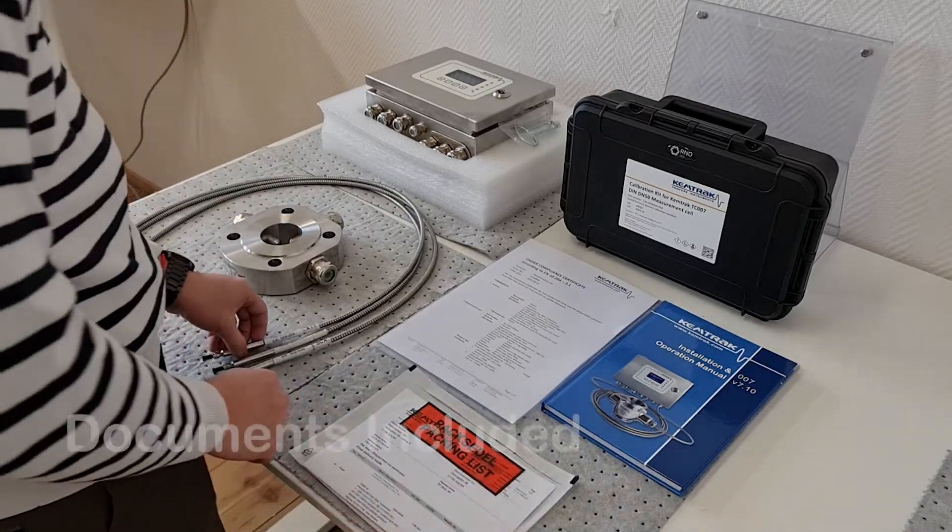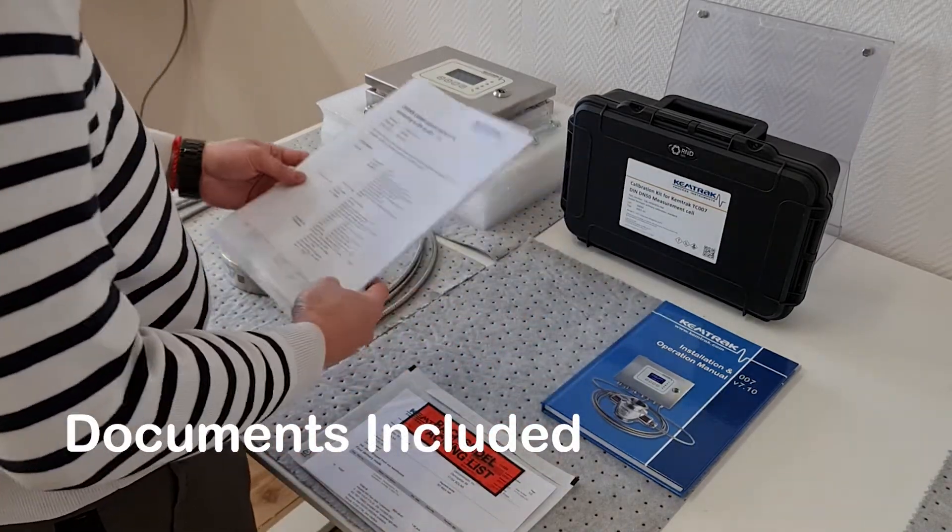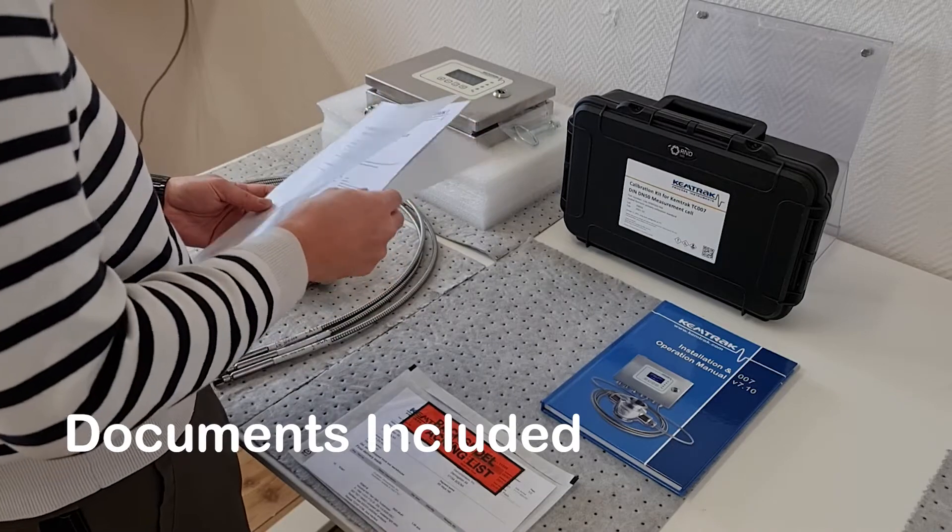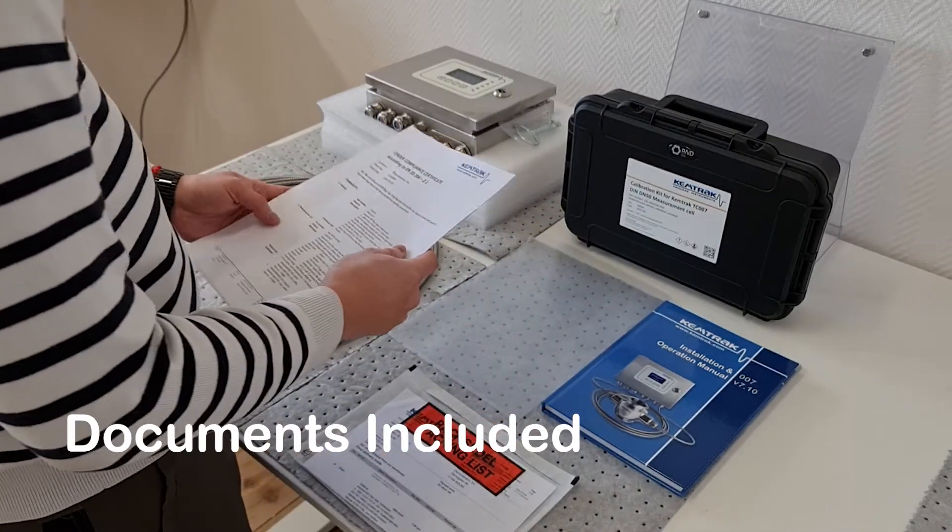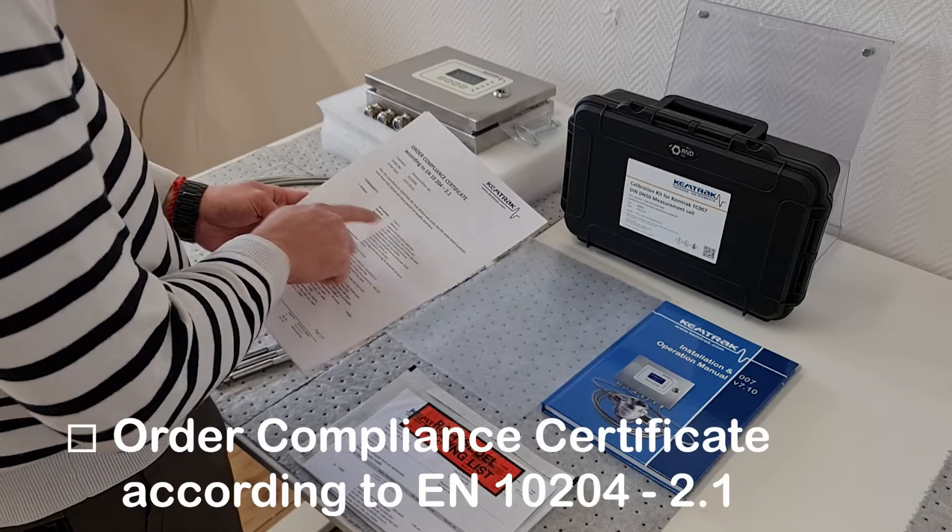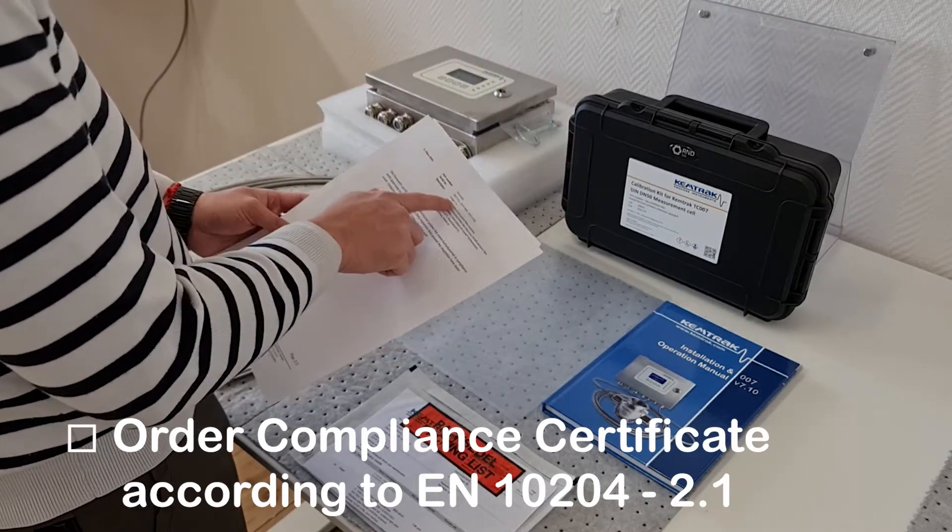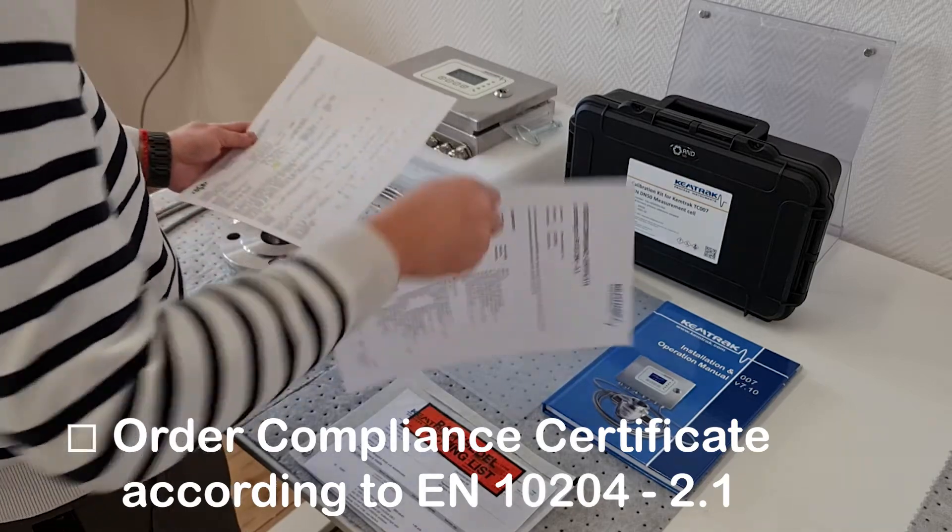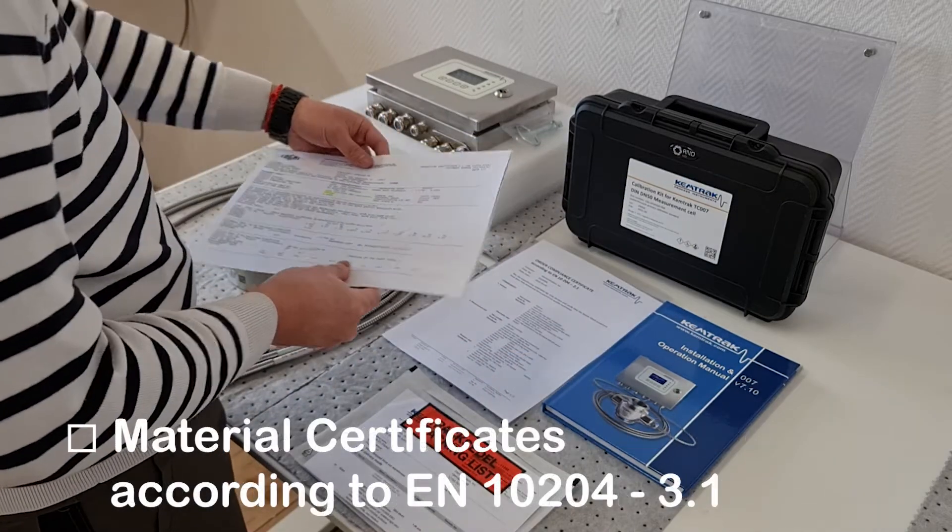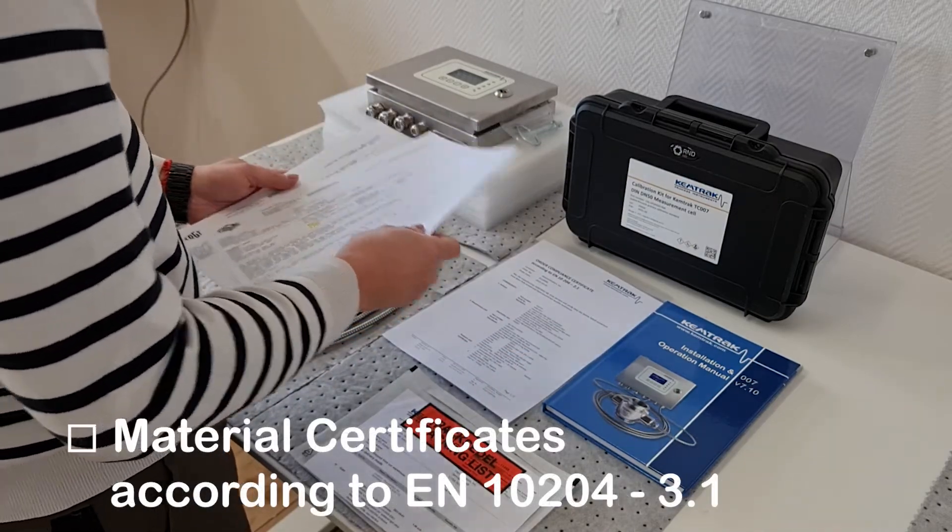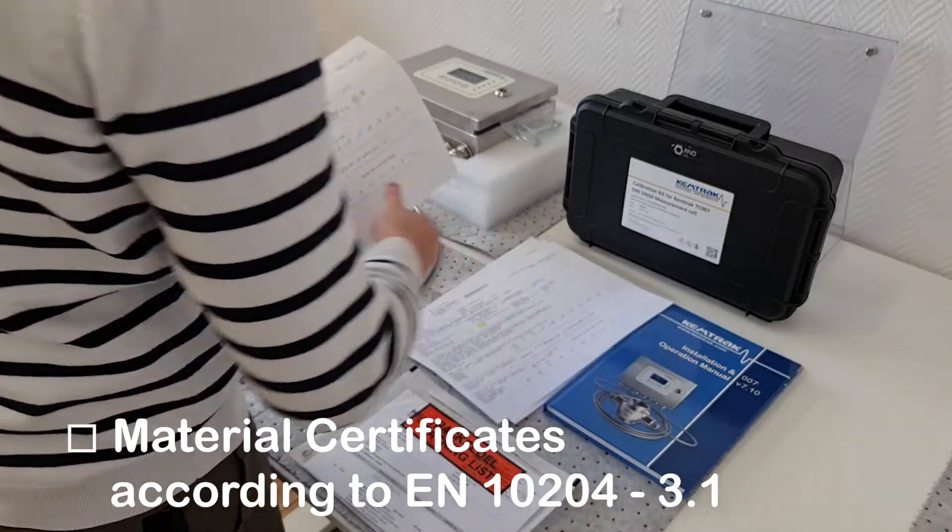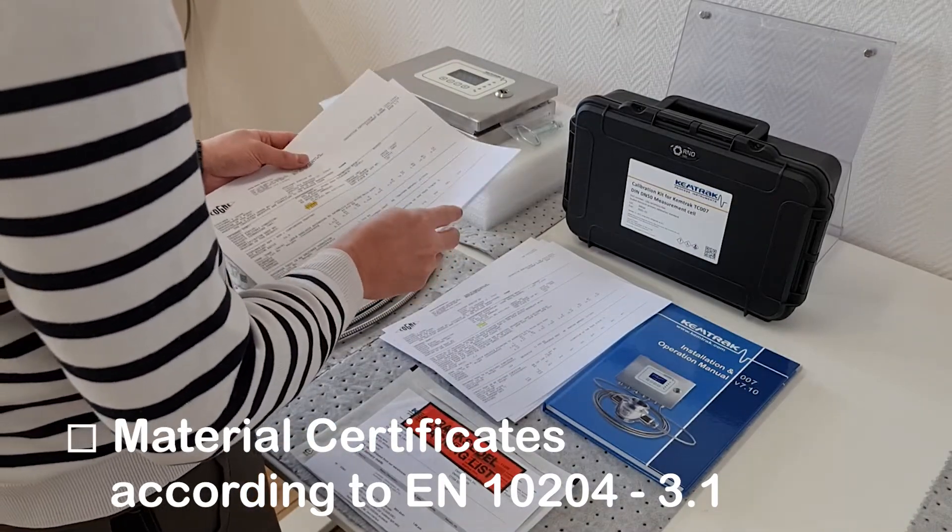The system delivered will also contain a package of important documents. The first document is a 2.1 order compliance certificate. This is a statement of compliance with the order by the manufacturer. The second documents are 3.1 material certificates that declares the metallic products are in compliance with the order requirements.